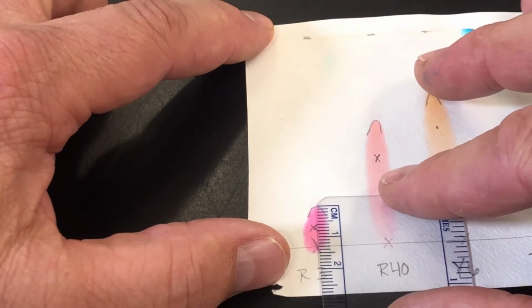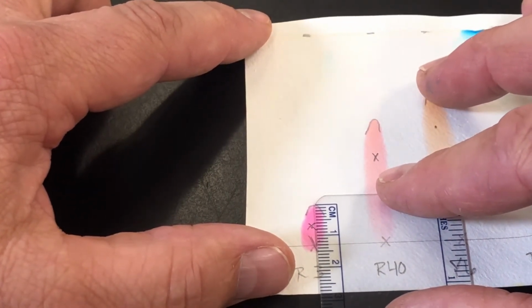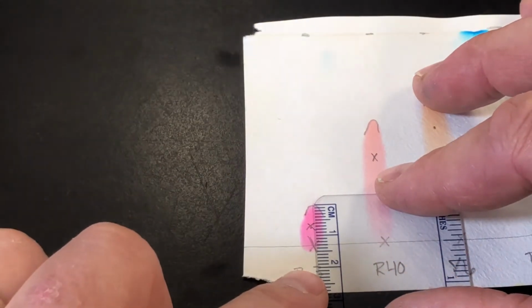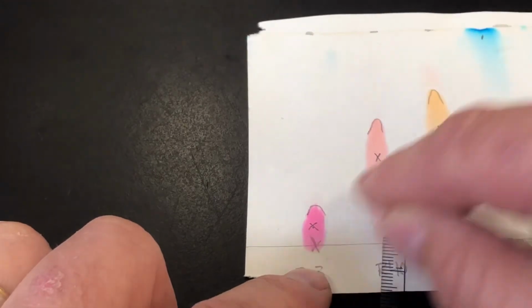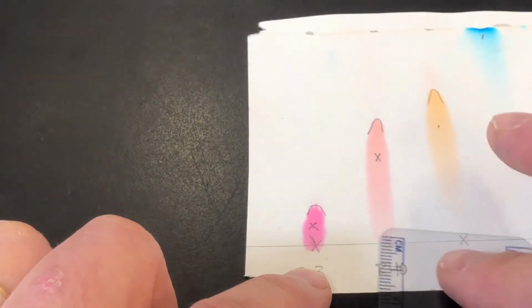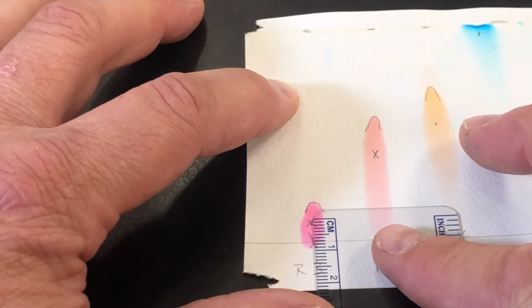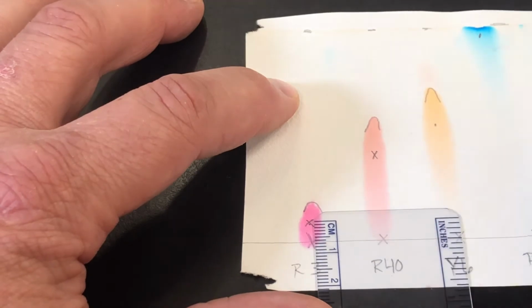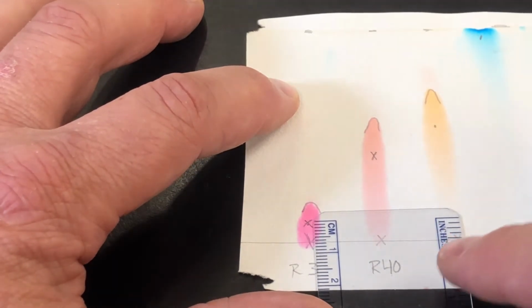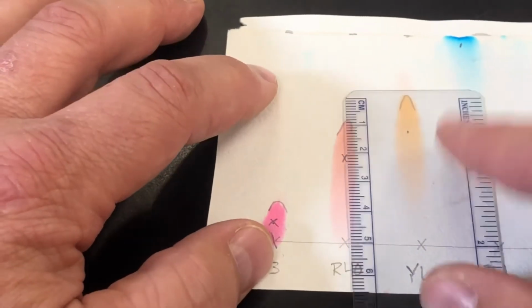The solute to the tip edge, if you wanted to do it that way, then I've got 1.30. Now, if you're going center mass, I've kind of marked where the center mass is, so you could also go to there, and that could also be measured at 0.70. So whenever you put together your tables, you can either do both of them, or you can do just one.